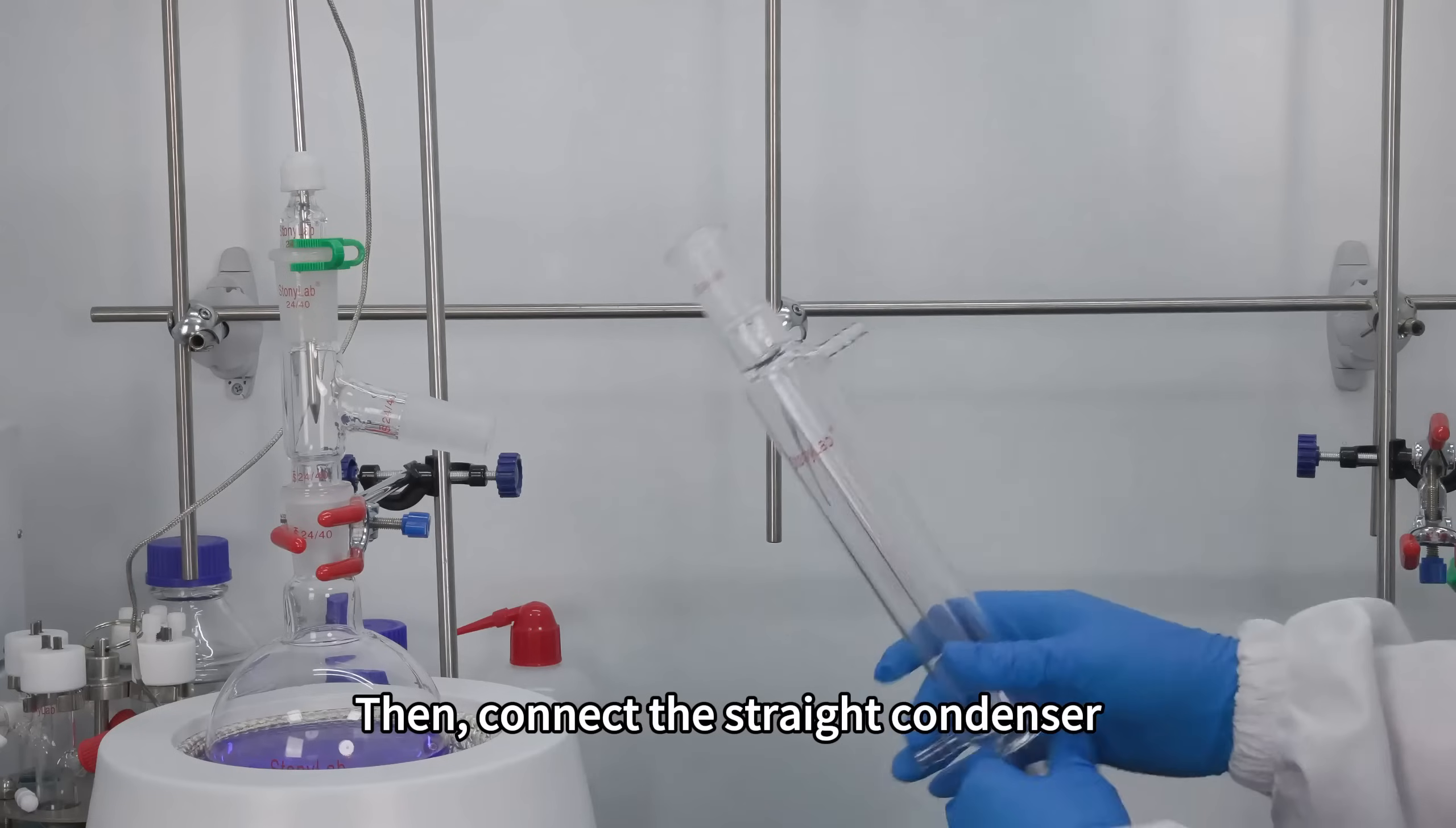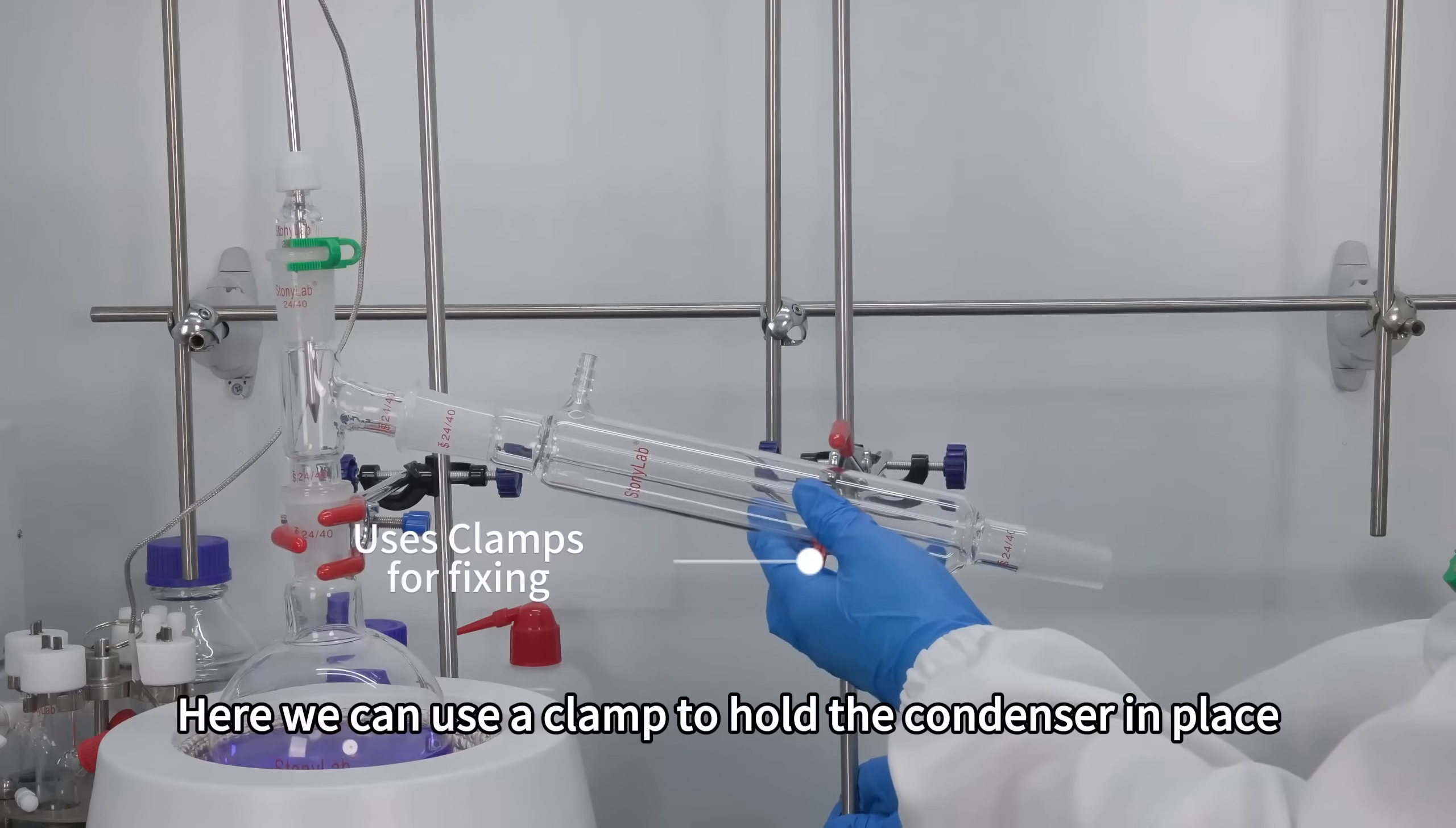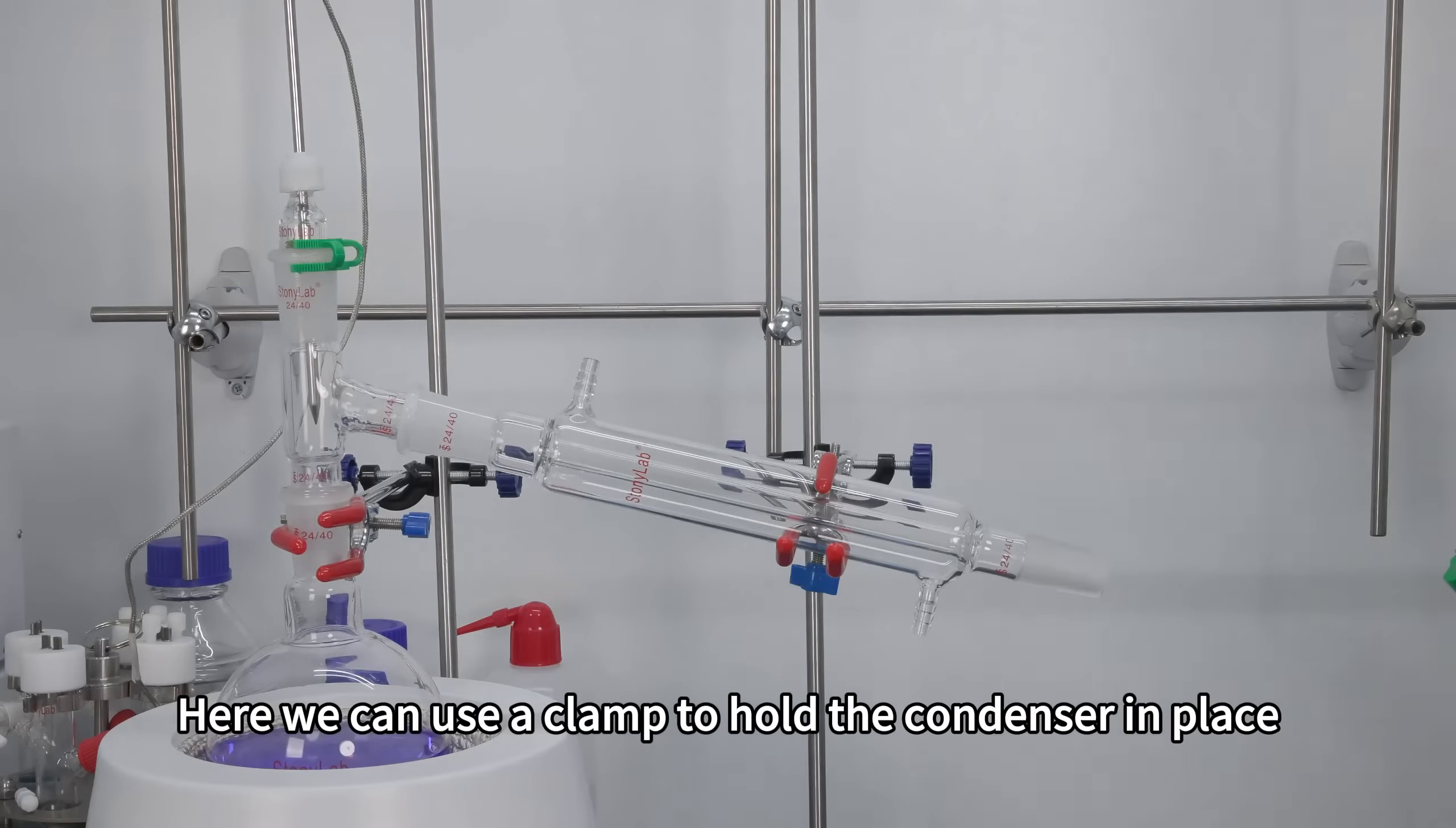Then, connect the straight condenser to the outlet end of the distillation head. Here we can use a clamp to hold the condenser in place.